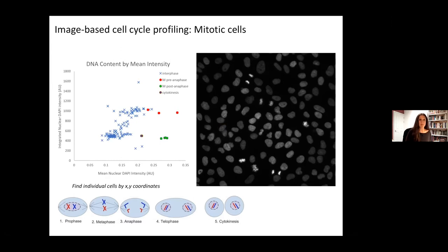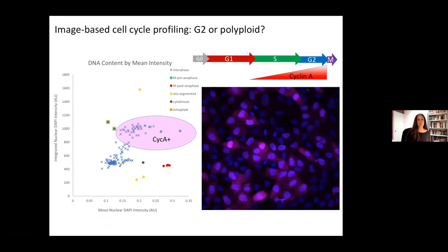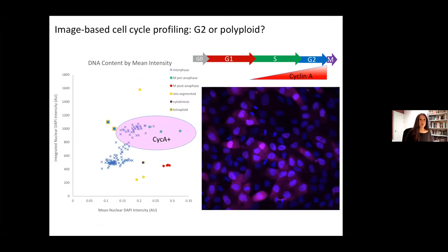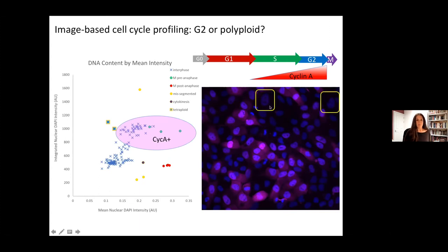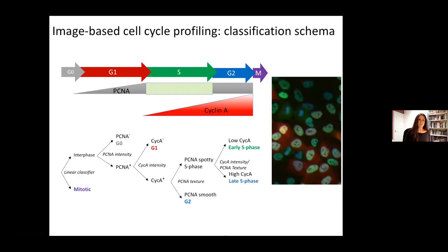We can also find mitotic cells by identifying small bright objects, and we can even determine whether they are cells which have gone through anaphase or cells which are still in metaphase. We can also add more labels — for example, cyclin A, which accumulates from the start of S phase. Adding this label gives us a belt-and-braces approach, so we can really rule out cells which are polyploid from cells which are actually in G2 and have replicated their DNA.